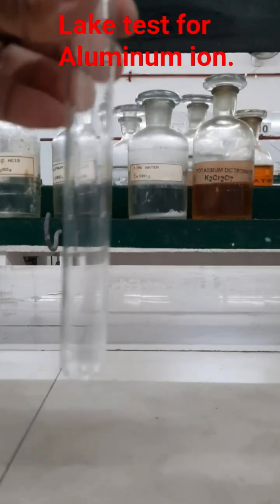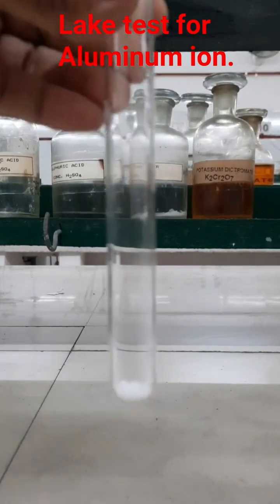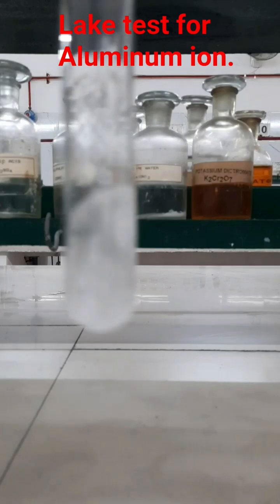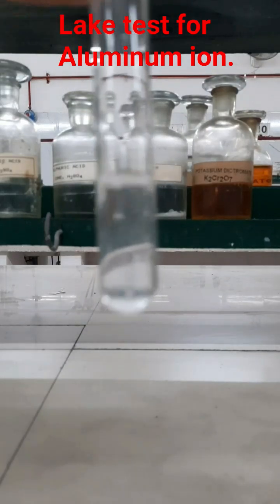Let us perform a lake test for the presence of Al3+ ion. First of all, I have taken a pinch of salt in a test tube, and then I am going to add distilled water to prepare an aqueous solution of the salt.